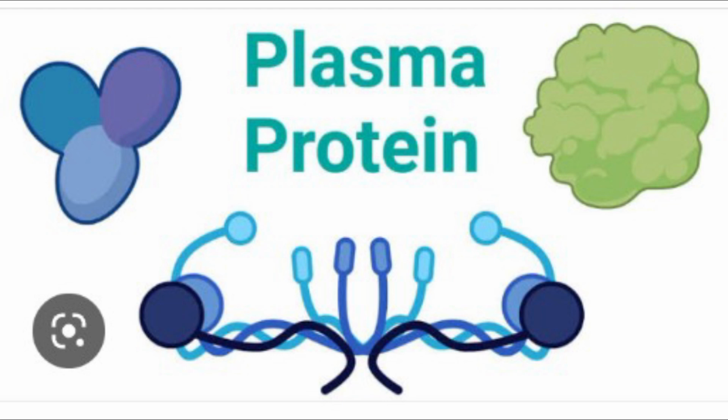Biuret test. This test mainly detects the presence of a peptide bond in the protein. The cupric ions in alkaline condition form a violet color complex with the peptide bond nitrogen of a protein. The reaction is dependent on the positive reaction given by the Biuret reagent.